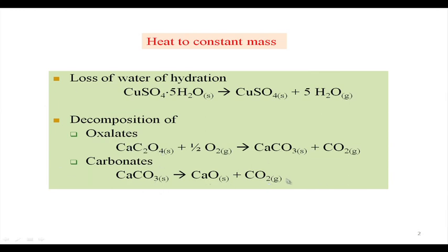a very important step to think of, where we can see the gases coming out from those samples, and we can analyze those gases very nicely. In one case you get the carbon monoxide. So, if the setup can be connected to gas chromatographic analysis, or gas chromatography attached to mass spectrometric analysis, the GCMS instrument, this gas analysis can immediately tell you whether the gas coming out from heating the sample is carbon monoxide or carbon dioxide.